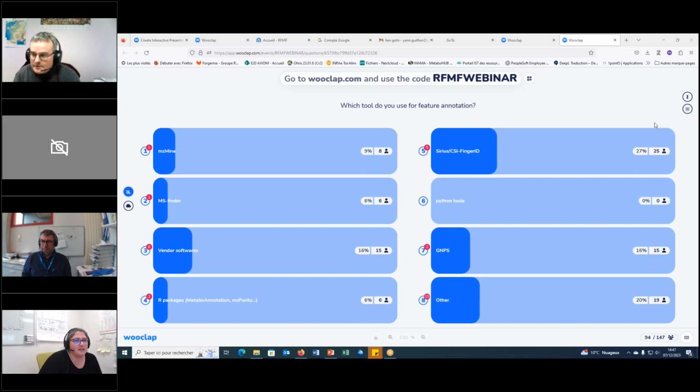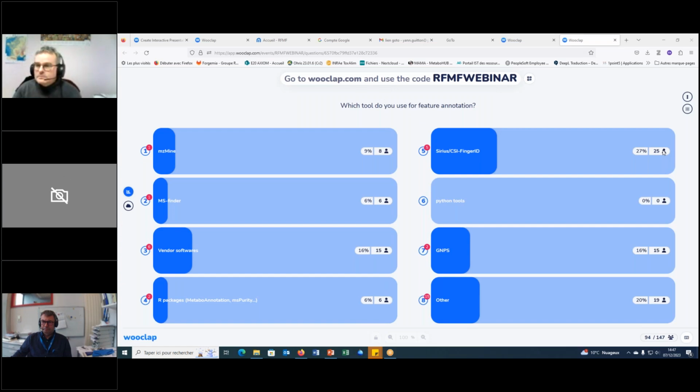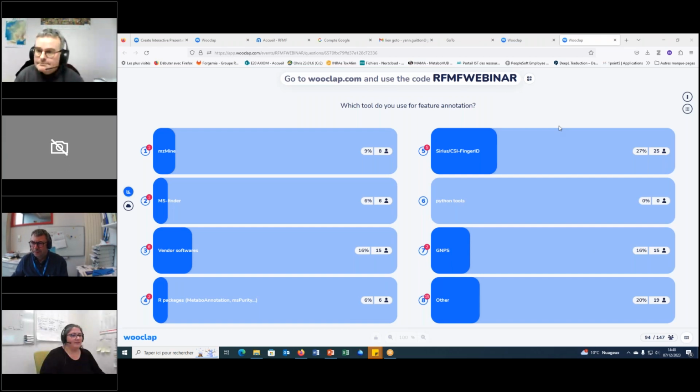As you mentioned, DDA can sometimes suffer from low quality. Yes, Loïc, if we go lower and lower, we have a decreased quality of the MSMS.